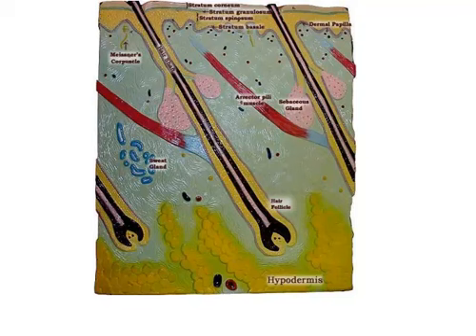In this particular cut, we can see the Meissner's corpuscle, and this one happens to be up in a papilla, one of those nipple-shaped areas right there. And remember, the Pacinian are going to be way down here just before you get down into the fat of the hypodermis, and they're going to look like a sliced onion.